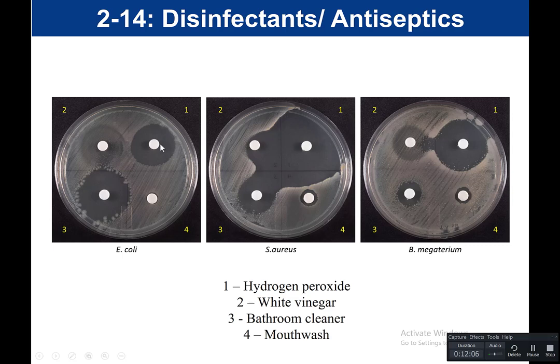Disc number one was soaked in hydrogen peroxide, and it's very effective — in all three cases it inhibited E. coli, Staph aureus, and Bacillus megaterium. For white vinegar, there is some effectiveness but definitely not to the extent of hydrogen peroxide. You would measure and record whether each result is sensitive or resistant, though without a ruler it's difficult to determine exactly. For Bacillus megaterium, the bacteria grew right up to the disc, so this would be resistant.